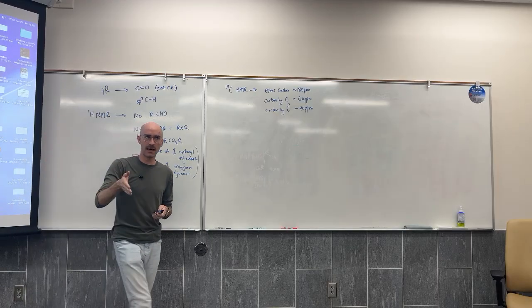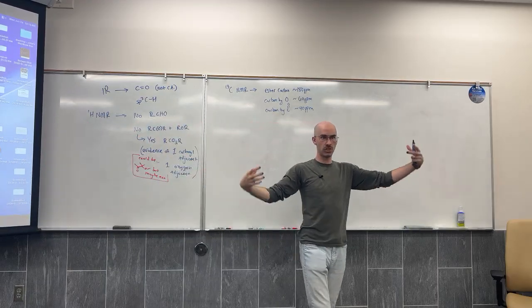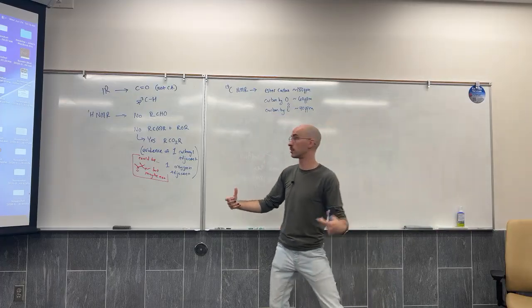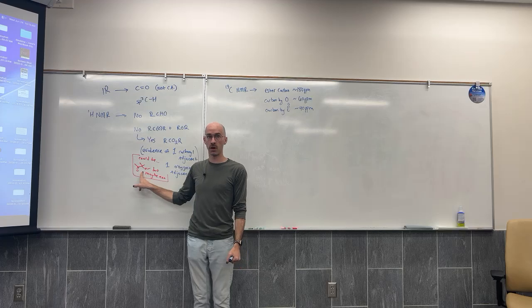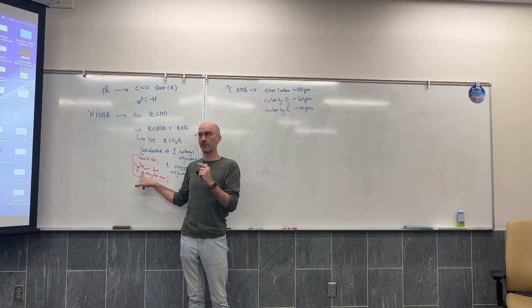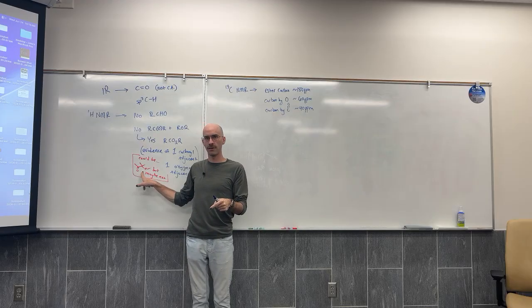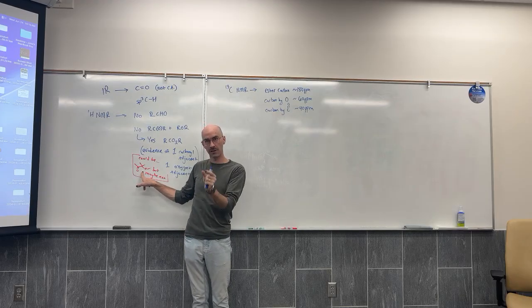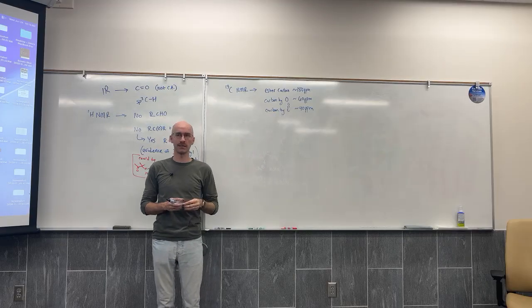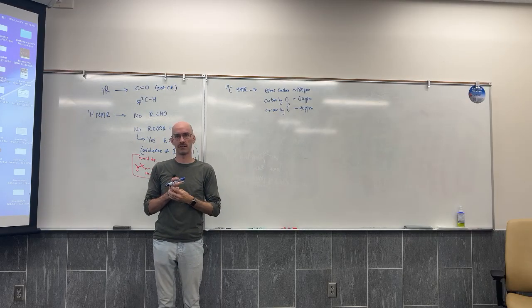I'm not seeing evidence of two carbons adjacent to carbonyls or two carbons adjacent to oxygens, which proton NMR, we said, maybe there's a way I could still have a ketone and an ether and not have hydrogens in between that would give me these duplicate 2 carbonyl hydrogens, 2 oxygen hydrogens. Carbon NMR says that's not the case. I don't have that many carbon systems going on.